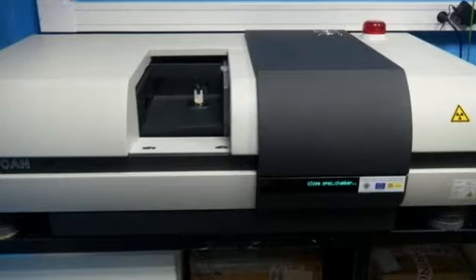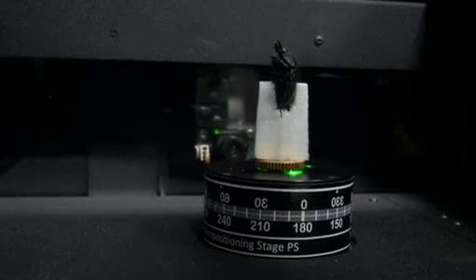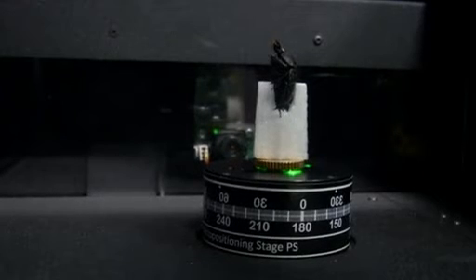Alba-Tursidor uses a scanner from Belgian company Bruker Micro CT, formerly SkyScan, which costs about a quarter of a million dollars. Similar to medical CT scanners, these machines are designed for much, much smaller organisms.